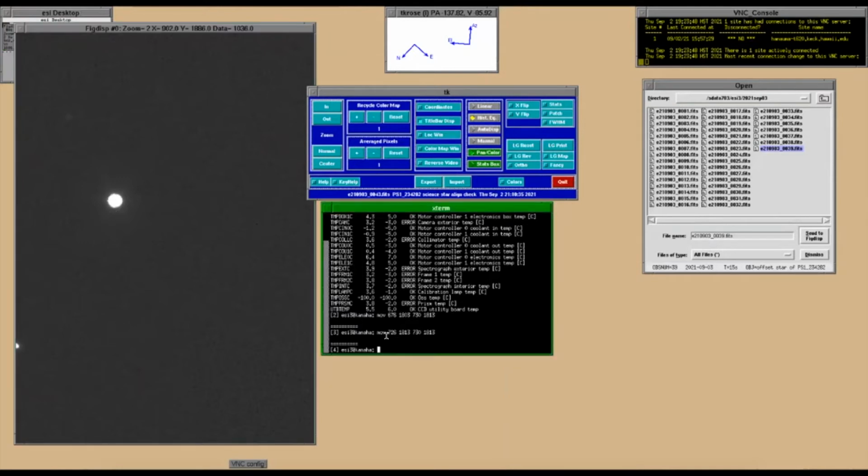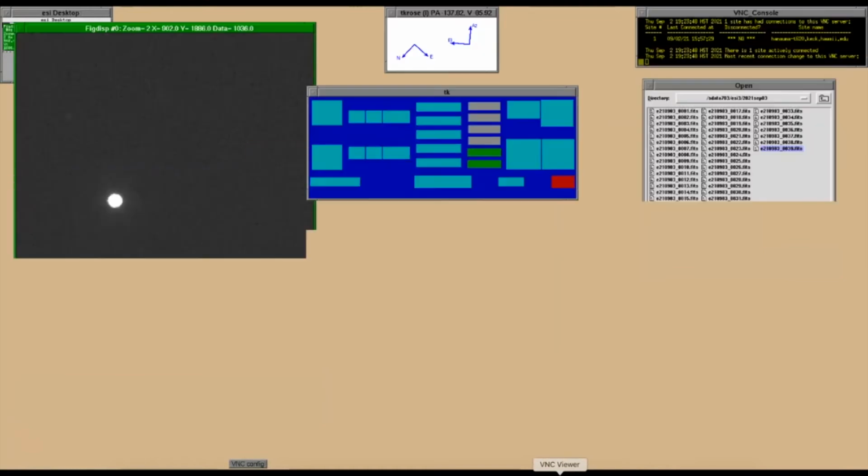So I should do a move 713, 1813, 730, 1813. Am I doing the right thing? Hang on, you typed 739. You're right. That looks correct. Oh, it jumped to the other screen. I think I killed my VNC.